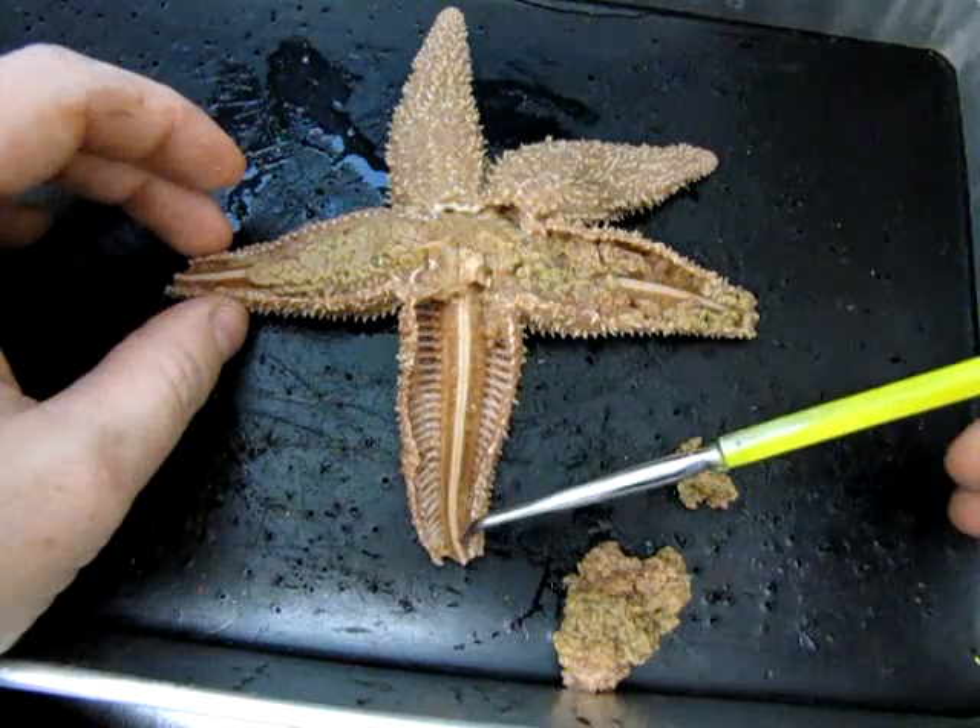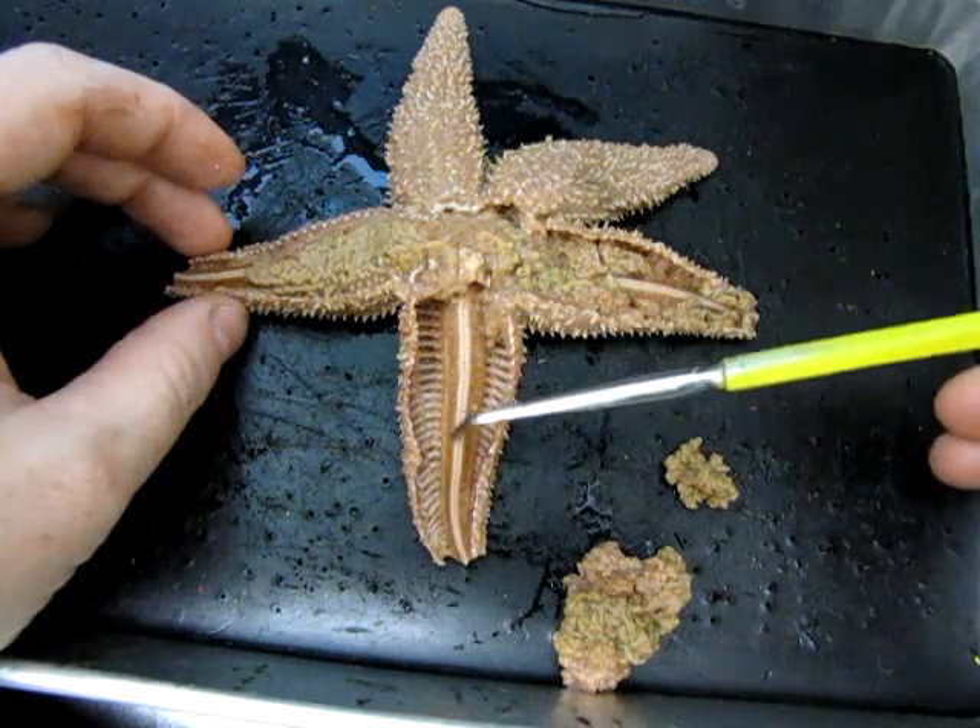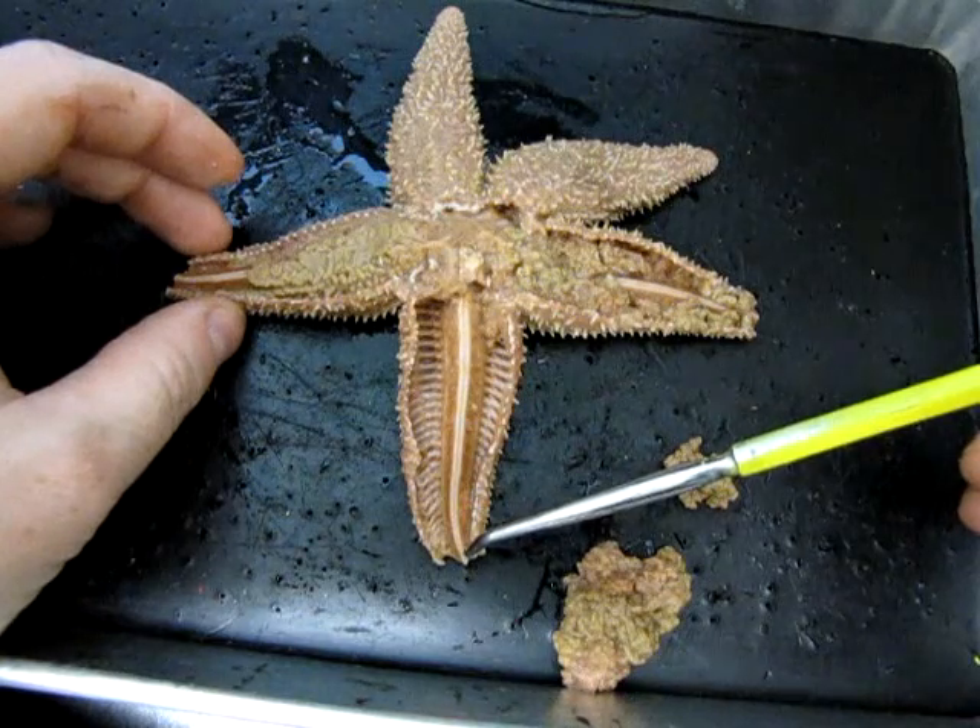Those small jelly-like structures are called ampoullae — or ampoulla in the singular. The ampoullae and the ambulacral ridge are both involved in the water vascular system.